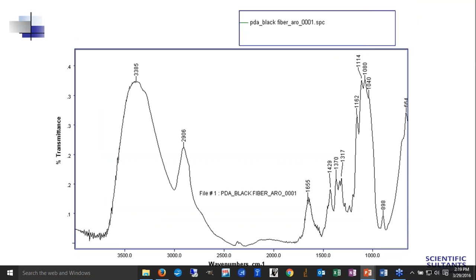By IR, we get a typical cellulose spectrum. For some cotton fibers, cellulose is a strong absorber, so this cellulose spectrum will dominate the IR spectrum. But for some that are dyed, we can get some information about the dyes while it's still in the fiber without doing extra steps and trying to extract that dye.